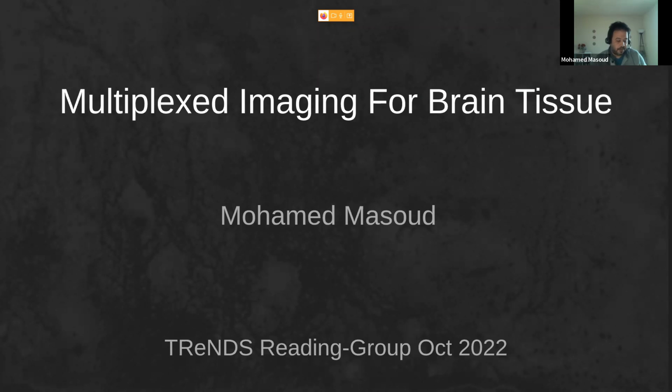Okay, thank you, Sergey. Today we will talk about multiplexed imaging for brain tissue. I think this domain is a novel one that has come to brain tissue, and mainly the need for scanning here.